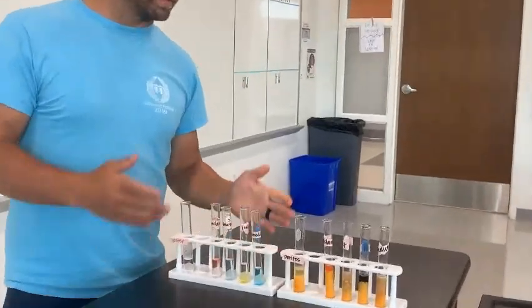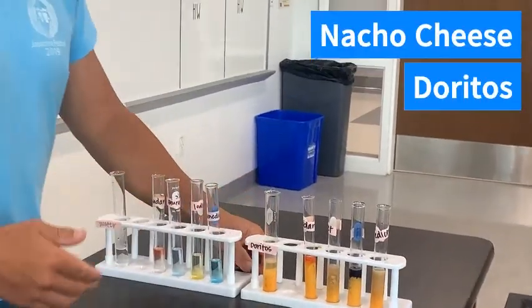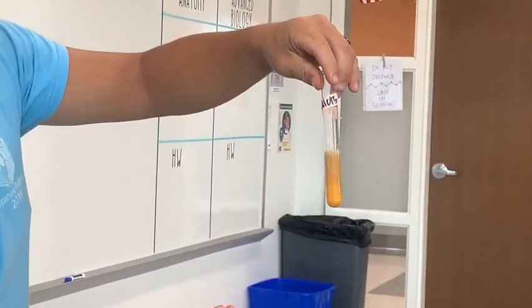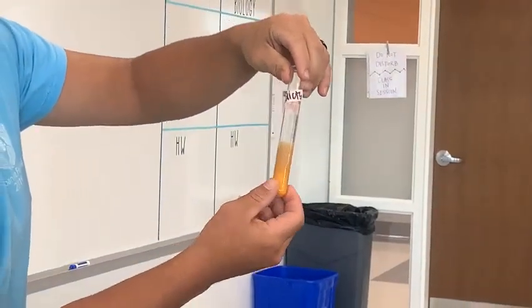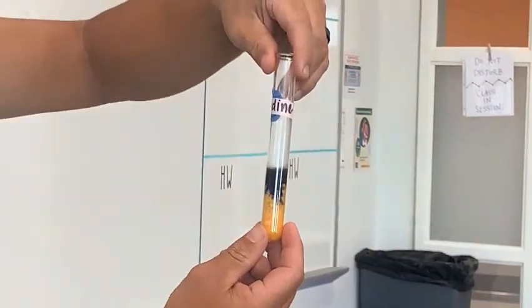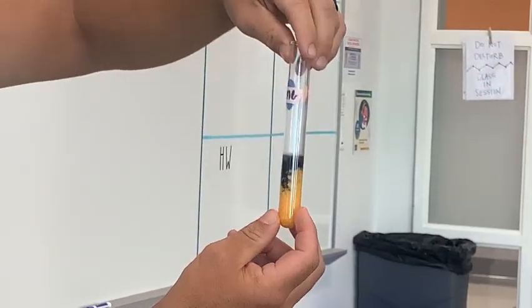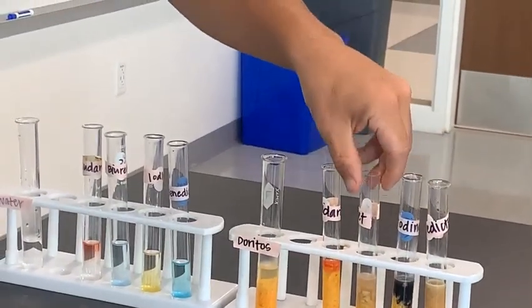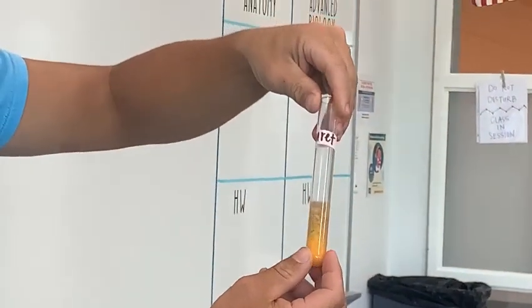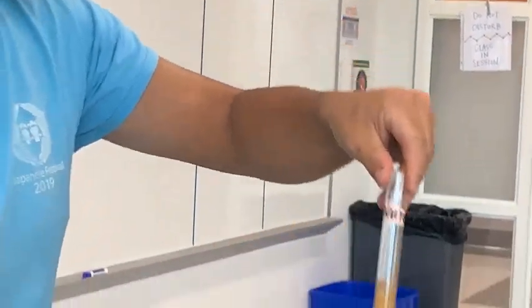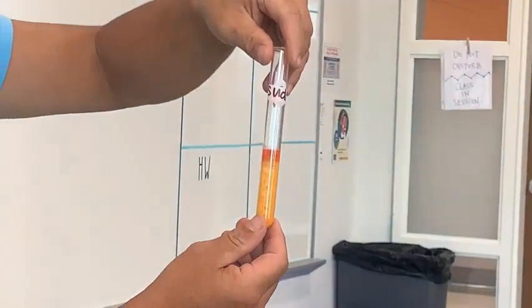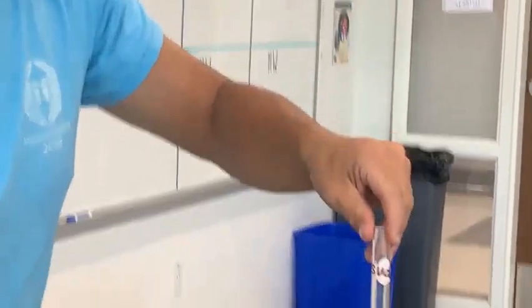Last but best part of my lunch was the Doritos. With Benedict's solution, there's already definitely a color change to a yellow — the orange is probably from the cheese Doritos. With the iodine test, look at that color change — the Doritos turned black, a great iodine test result. With the Biuret test, while the blue isn't really there, it's not a purple either — not the color change we're looking for. And with Sudan, there is a dark ring of red — definitely a color change from the light pink it started.